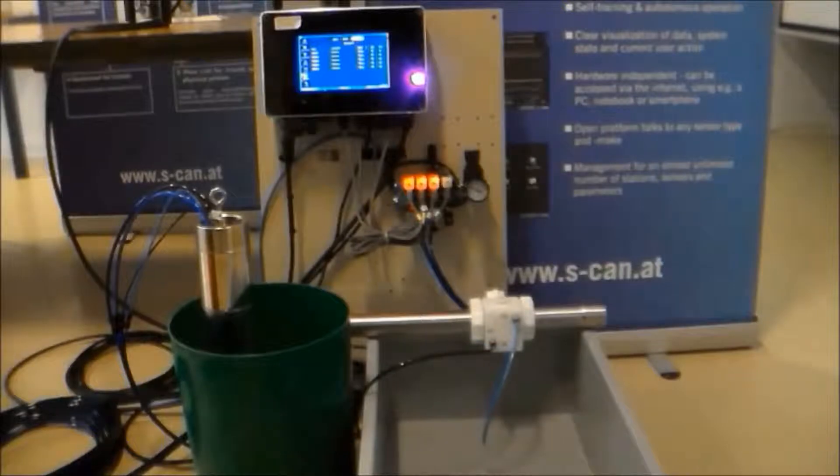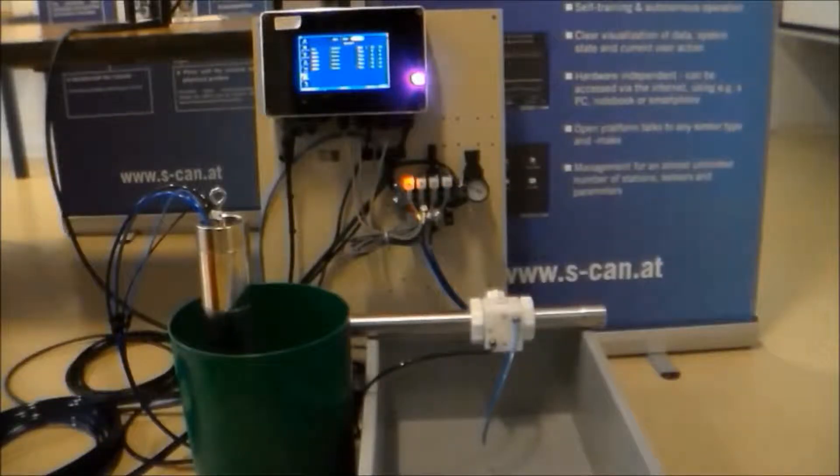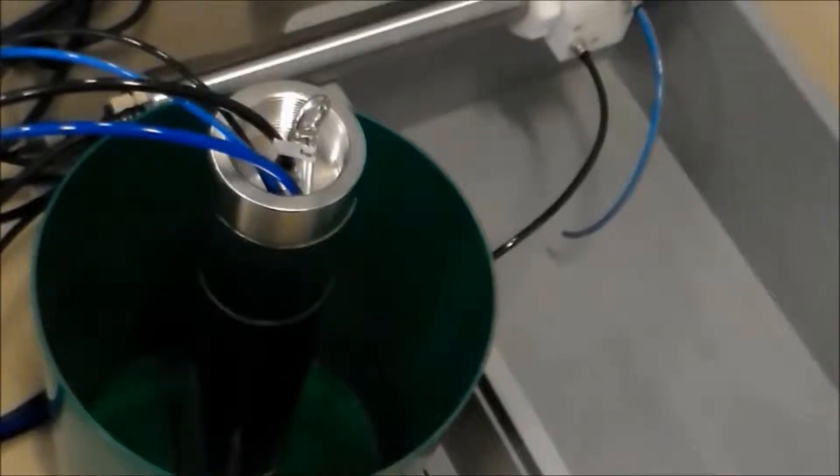In the first step, a valve opens, a vacuum is generated and water from the green bucket is sucked into the pump. Then, further valves are switched and the water gets pushed through the pipework and delivered to the flow cell of the spectralizer.